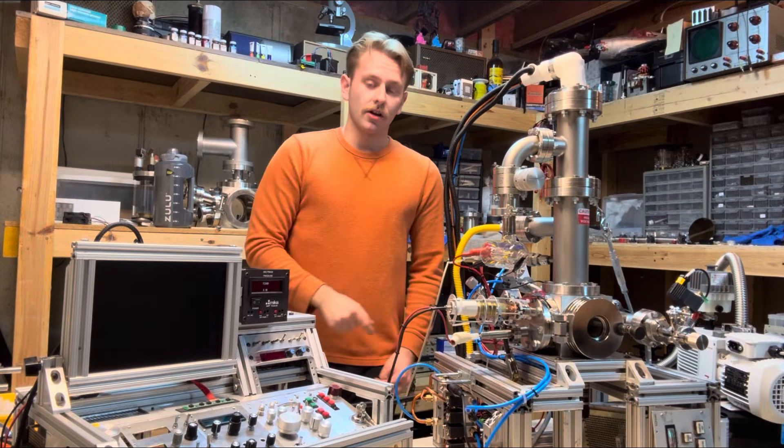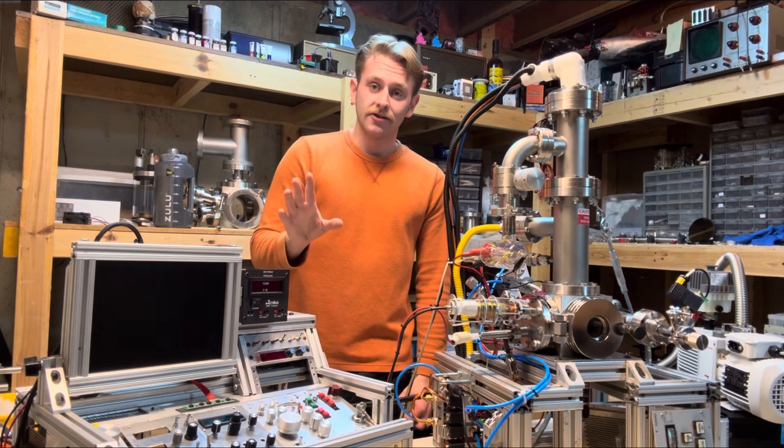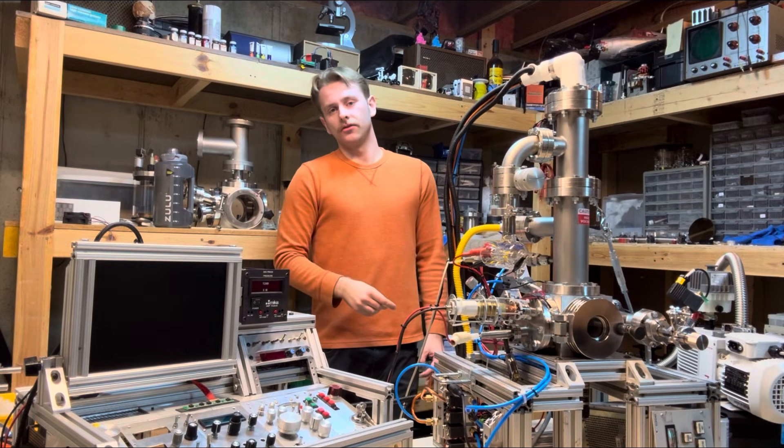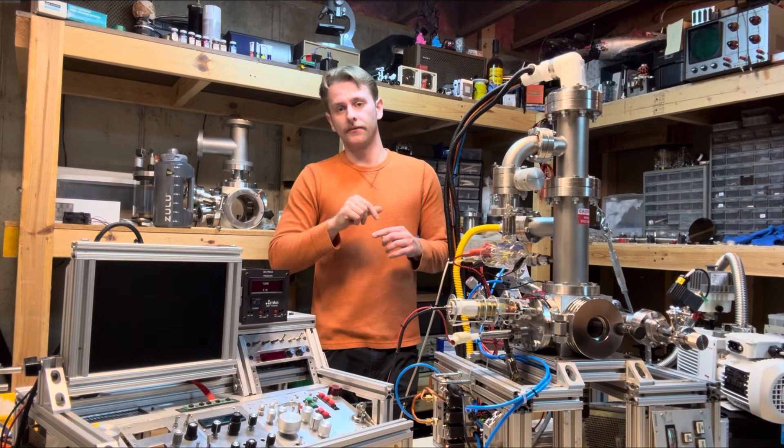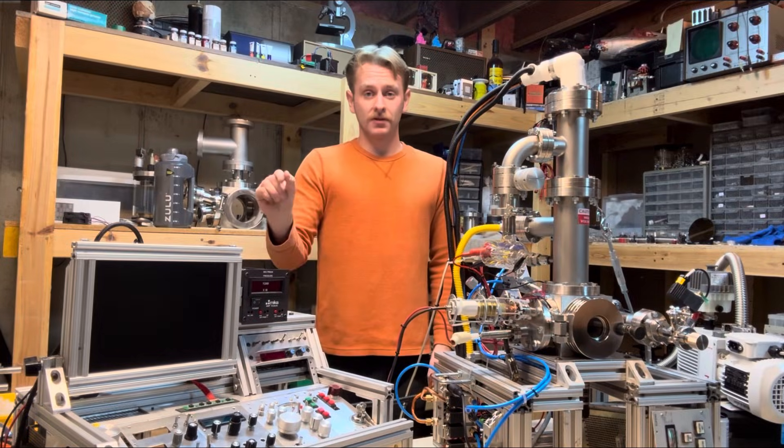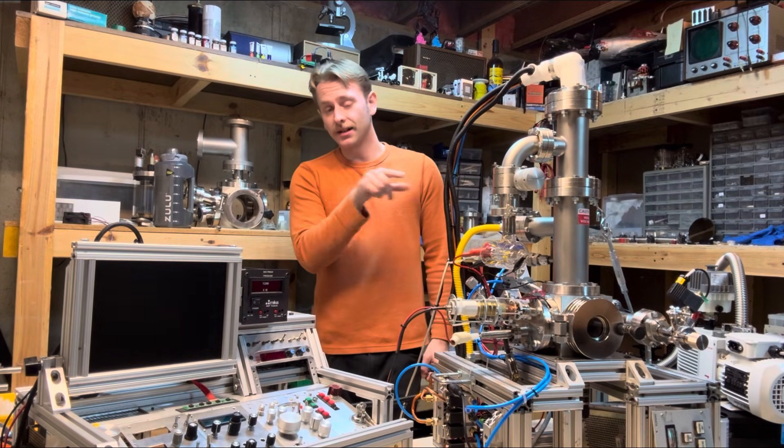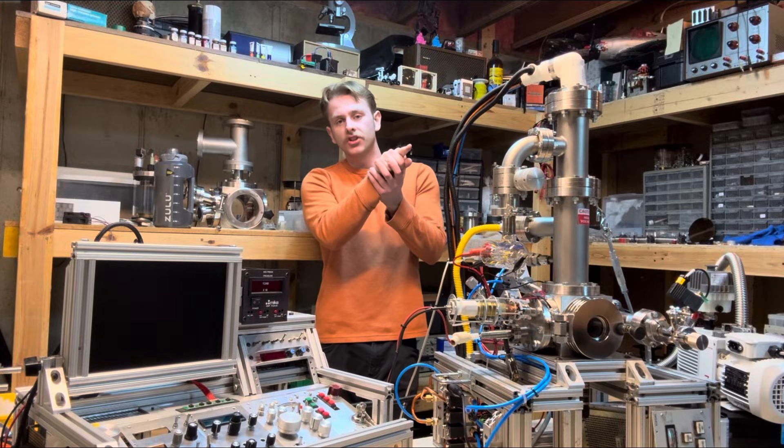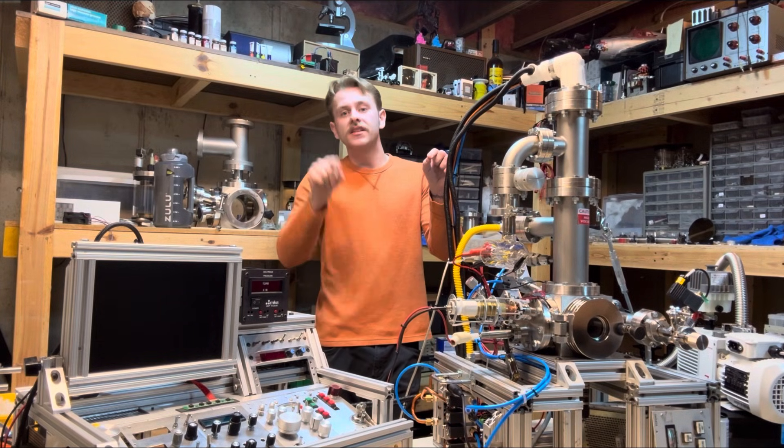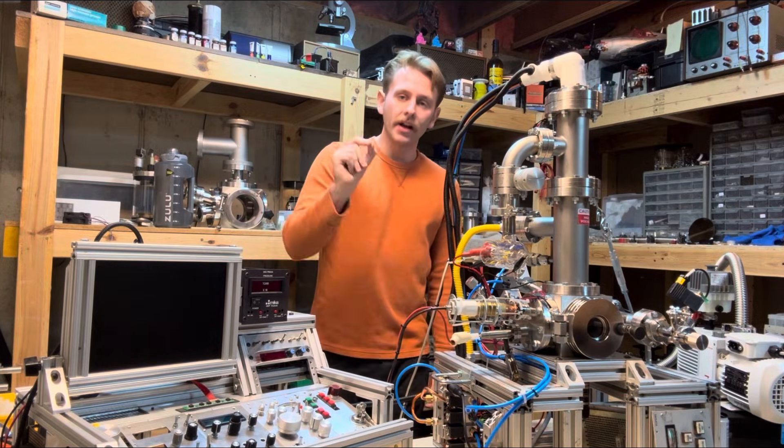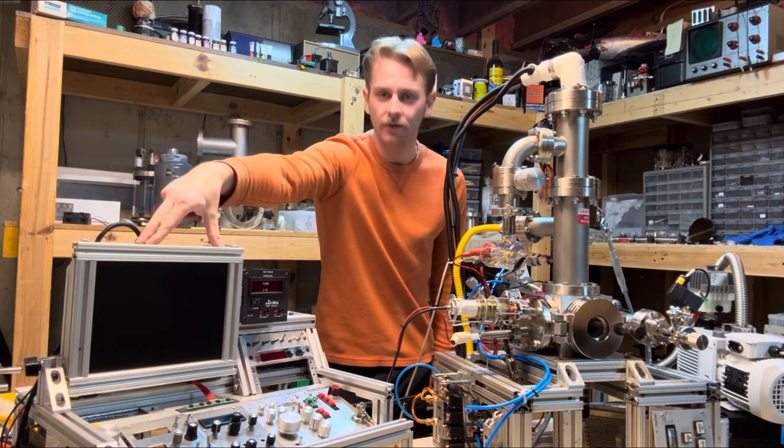That current pulse, I'll use a transimpedance amplifier. Sorry for getting too Star Trek, Star Wars on you here. Well, I'll use that to turn that into a voltage pulse. And that voltage pulse is mapped with the X and Y coordinate system that I was just talking about earlier with the scanning plates. So it's like, okay, I measured here. All that magic happened right here, and I got this many volts out of that. And so I'll take that, and that's going to be the brightness of the pixel that I'm plotting on this screen right here.